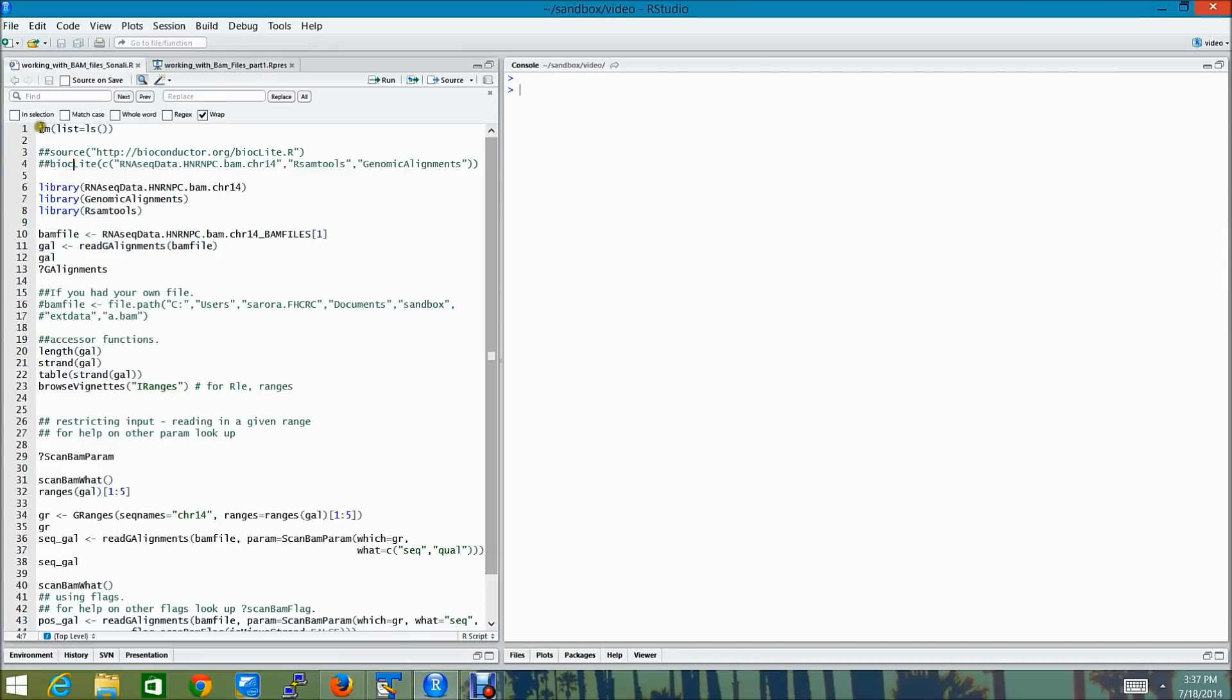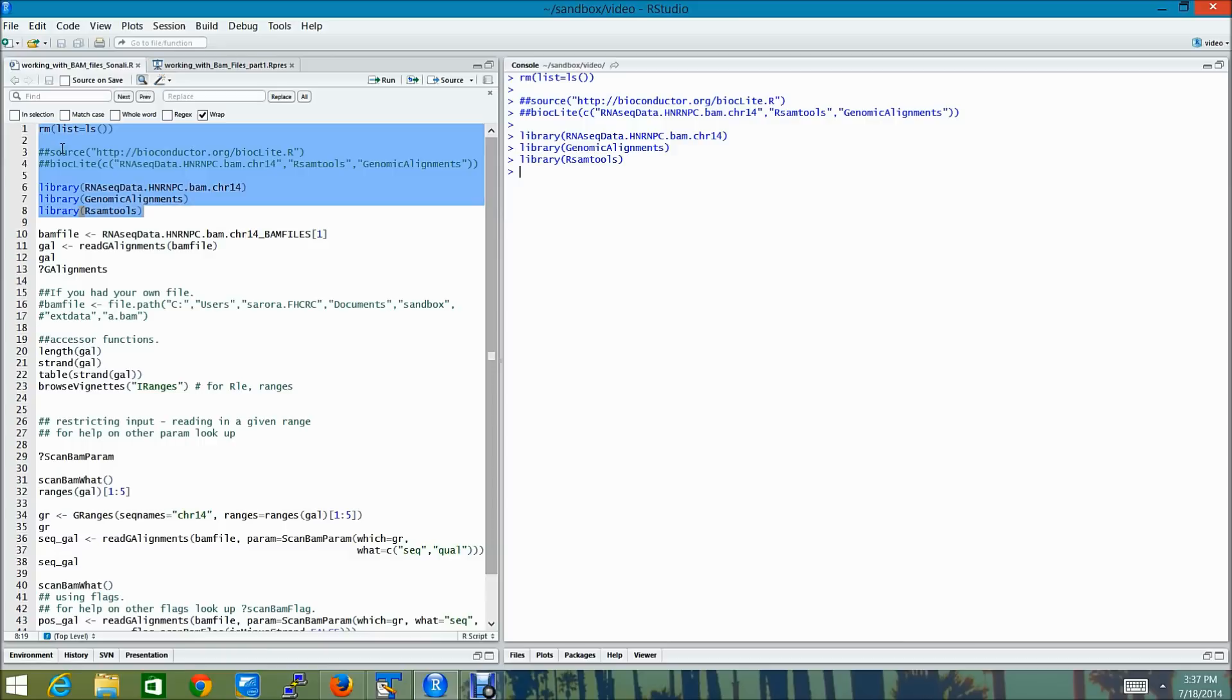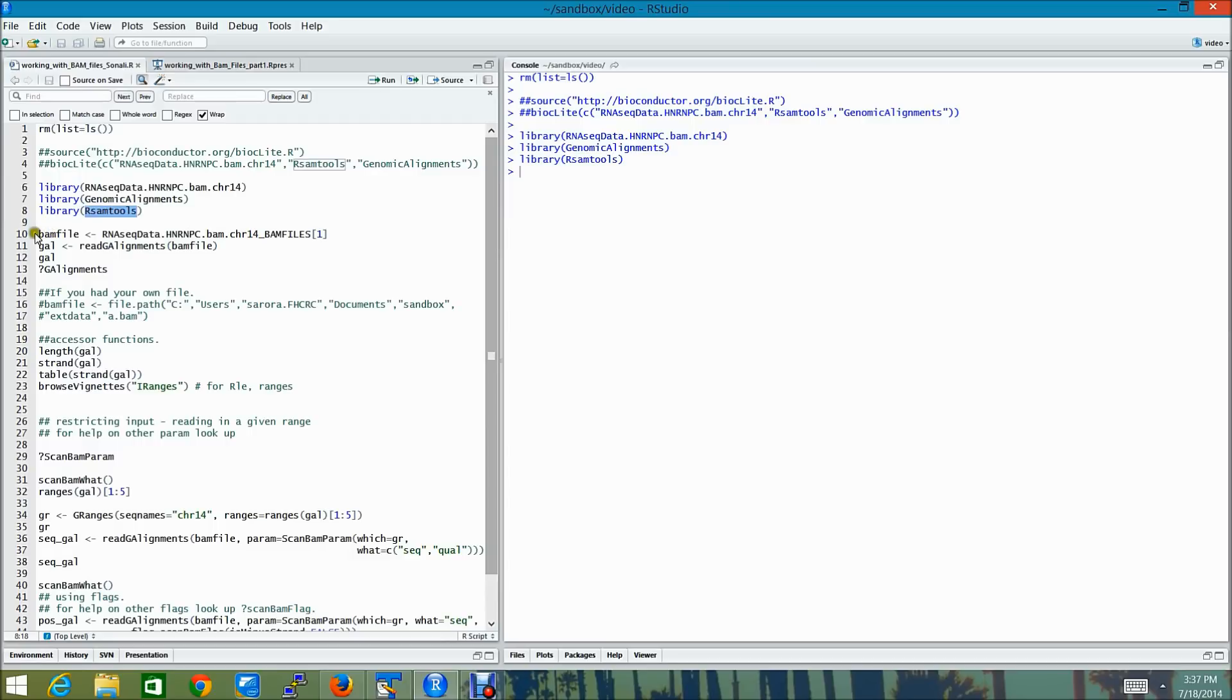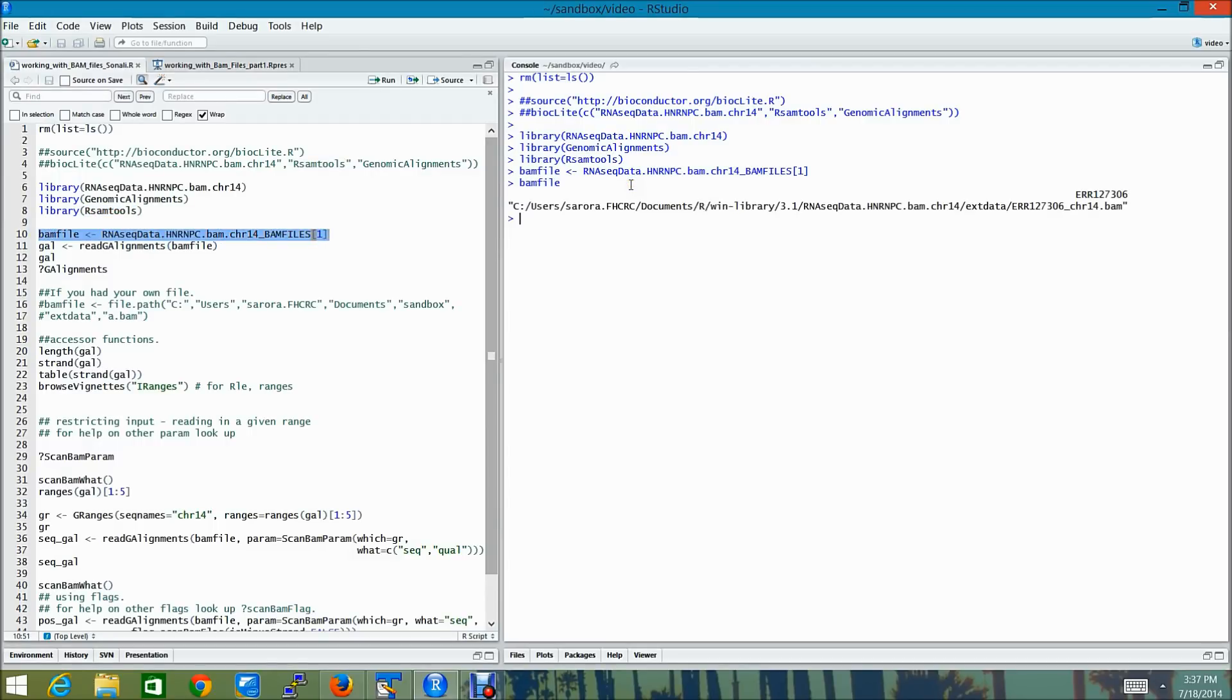So let's start with our demo. Our demo requires three packages. One of them is an experiment data package which contains eight BAM files and the other two are software packages. Let's read in the path for the first BAM file into this variable called BAM file. And then I'm going to read in the data from the BAM file into this variable called gal.